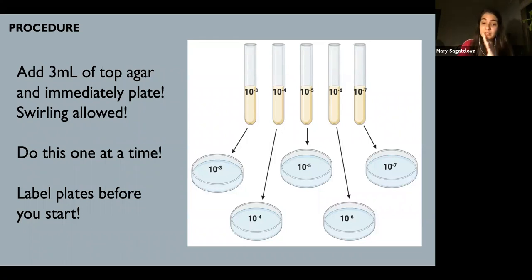Add your top agar, plate it. Add top agar, plate it. Top agar, plate it, okay? And make sure everything is labeled before you start doing this. Even if you think you're going to remember which one is which, and you say, oh, I'll just write the dilution after they're solidified, you won't remember. Just do it before, okay? Save yourself some time.